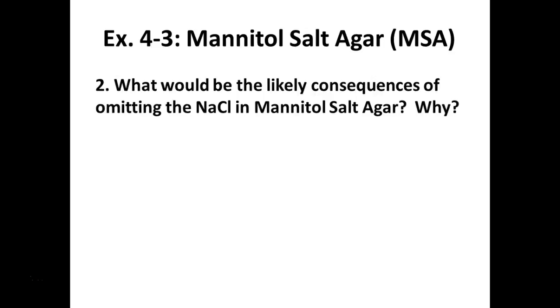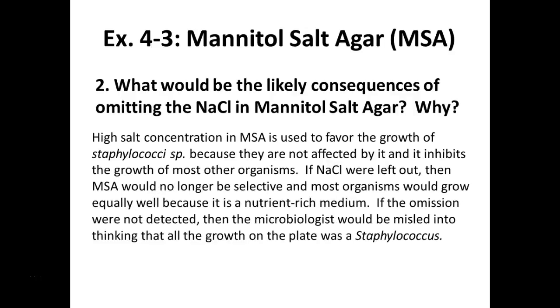So what would be the likely consequences if we omitted the salt from the mannitol salt? The plates would no longer be selective, right? Anything would grow. And that would be bad, because part of the reason we're using that media is to select for salt tolerant organisms, like Staphylococcus.